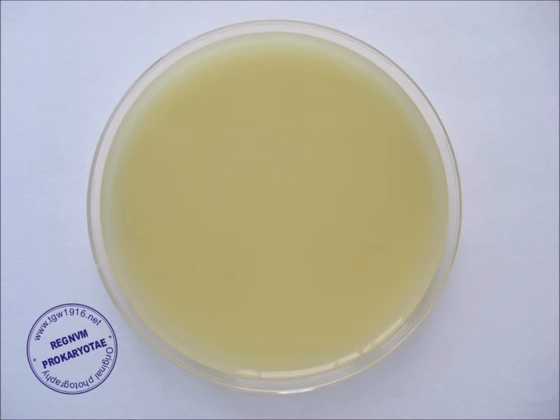Now, for the medium — I didn't talk much about that yet. I believe agar is the best part and the most fun part. You can either make it yourself, which is cheap and cost-efficient, or you could order pre-made ones. They're all fairly cheap — you could get about 500 petri dishes for only $29.99.